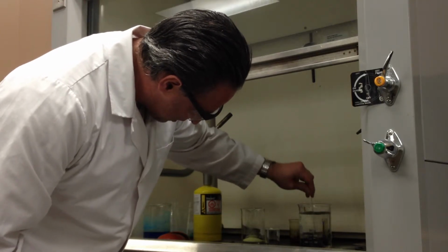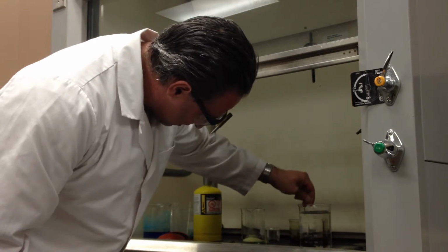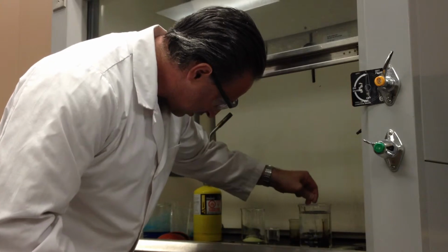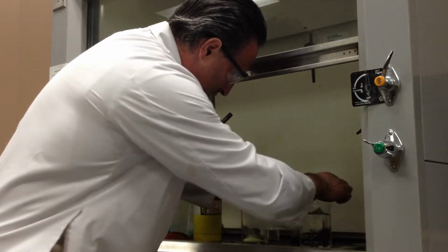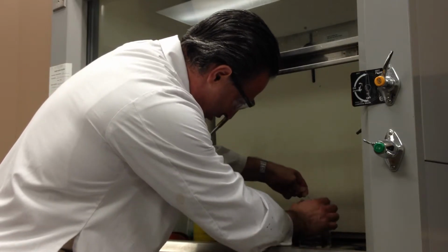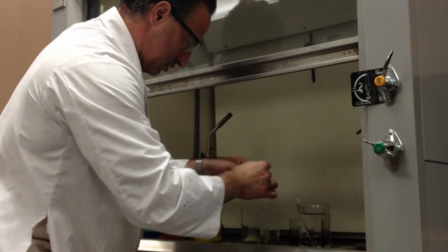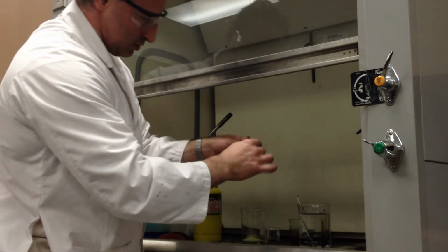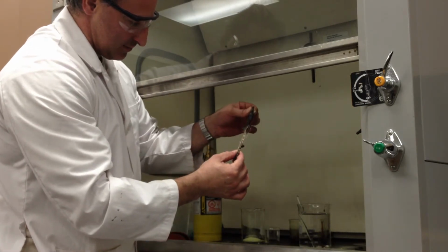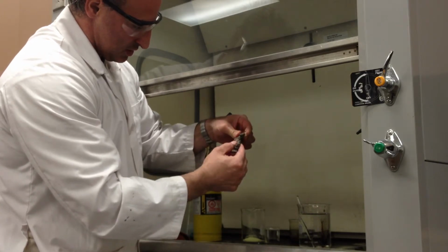It forms an amorphous mass that is not solid. It can actually be, there's amorphous sulfur. Oh my god. Its plastic properties. Kind of messy.